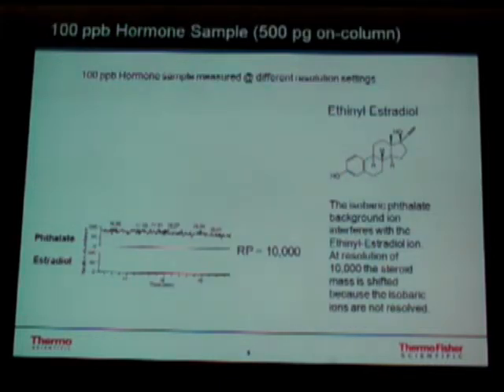So what does this really offer you? What's the tremendous power it brings? This is an example. I think most of you who have run LC-MS must be quite familiar with the problems with phthalates. There is constant background at around 270 amu, which comes from PEEK tubing and other parts of your HPLC, and that constantly raises the background.